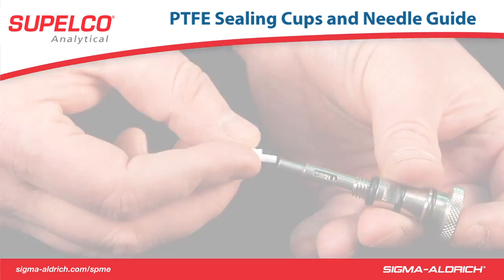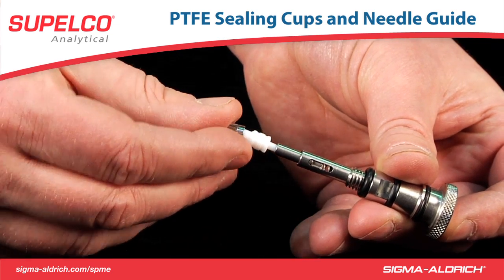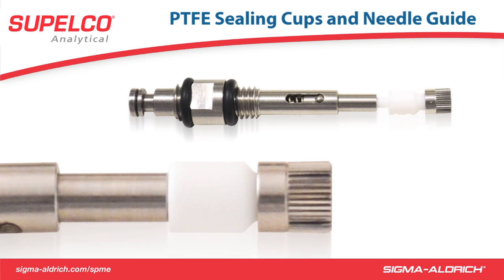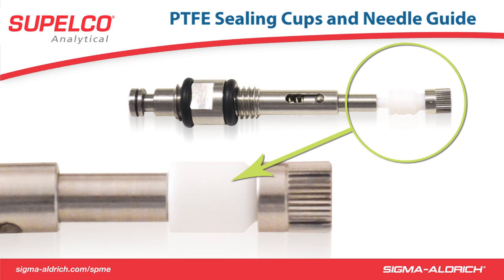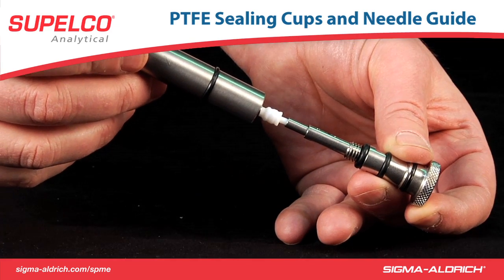The selected PTFE cup is pushed into the needle guide and then screwed into the sealing mechanism. The spring load ensures a tight seal of the cup with the FFA fiber needle. The assembled sealing mechanism is then placed back into the plunger.